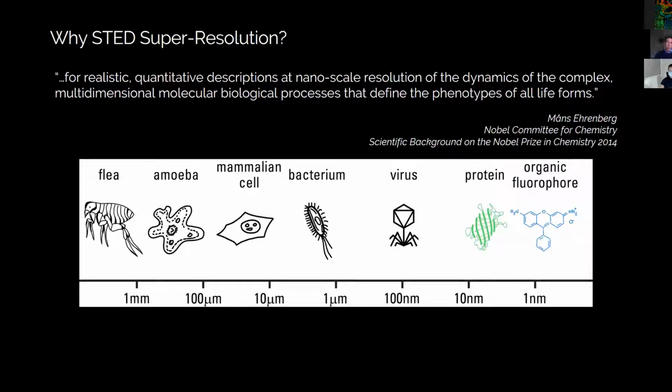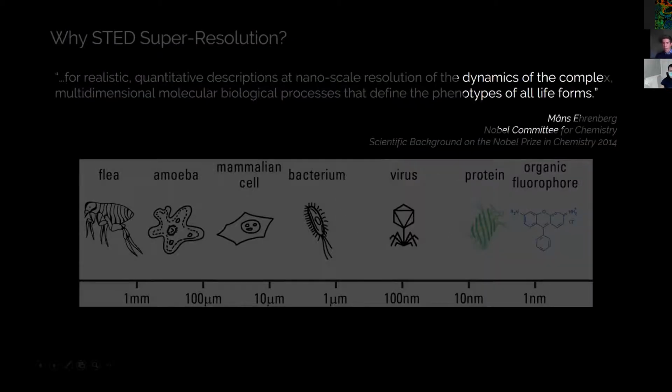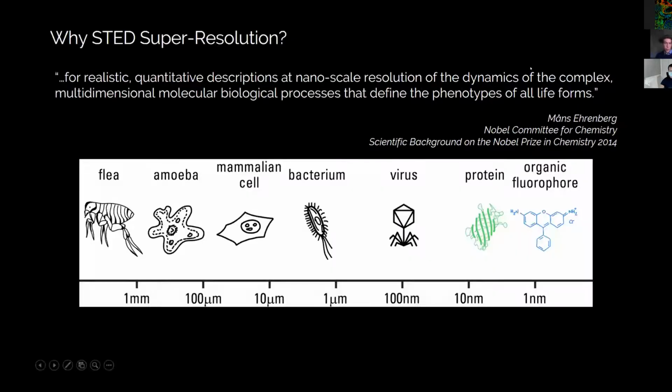Wow, that's a lot of information, basically packs everything that we want in microscopy in one sentence. And of course, all this is true for super resolution methods and specifically for STED microscopy. Otherwise, they wouldn't have awarded it with the Nobel Prize. However, if we are brutally honest to ourselves, then the dynamics part has been lagging a little bit behind in super resolution microscopy in general.